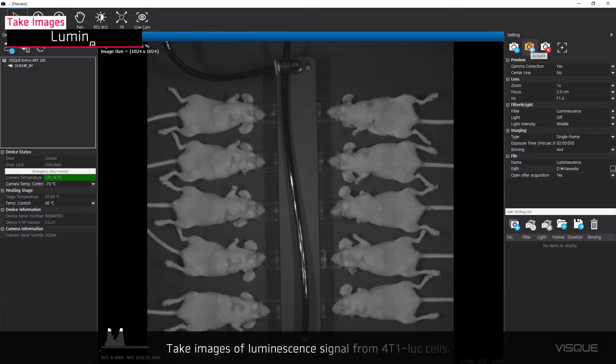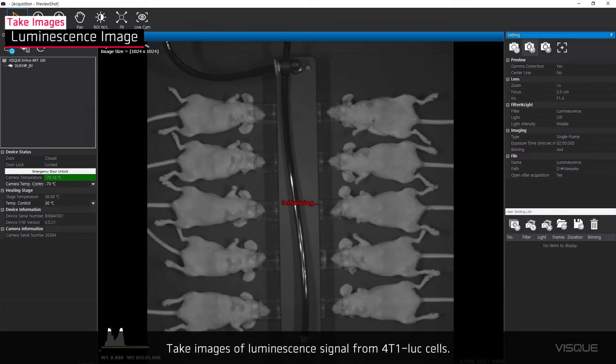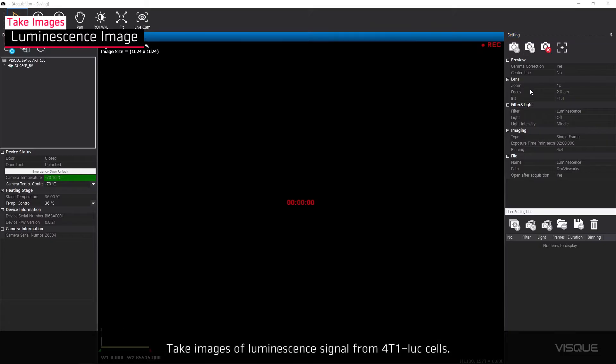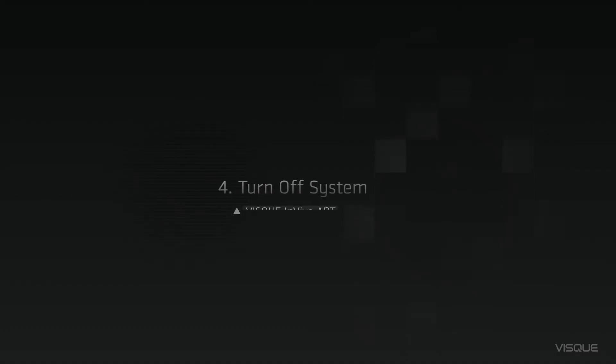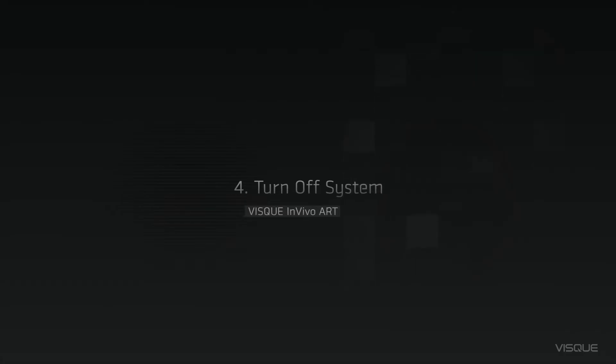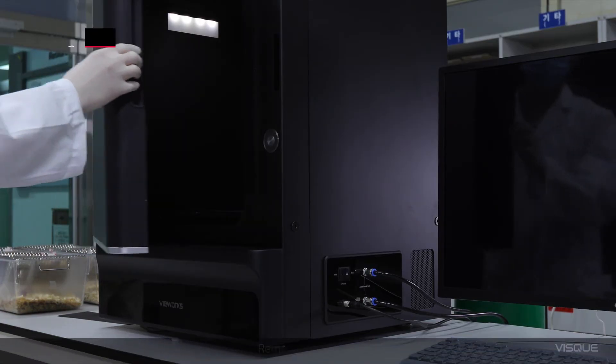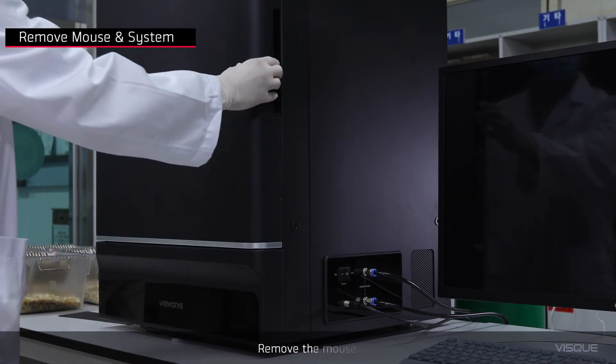Take images of luminescent signal from 4T1-Luc cells. Remove the mouse.